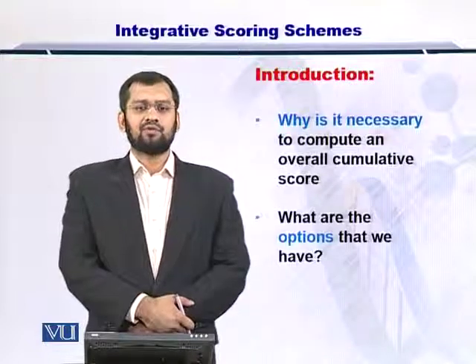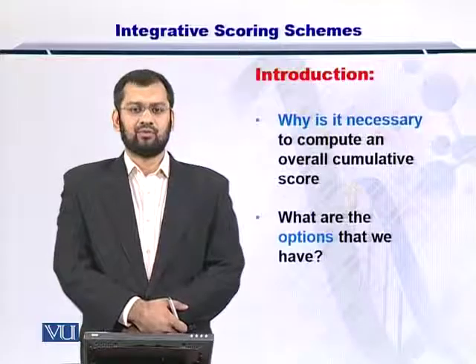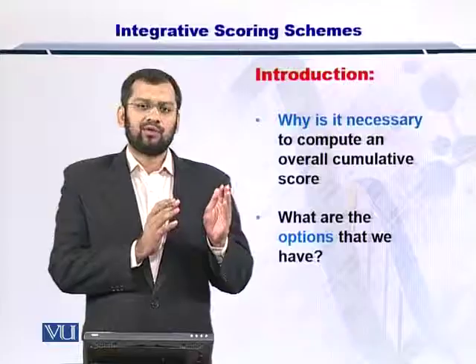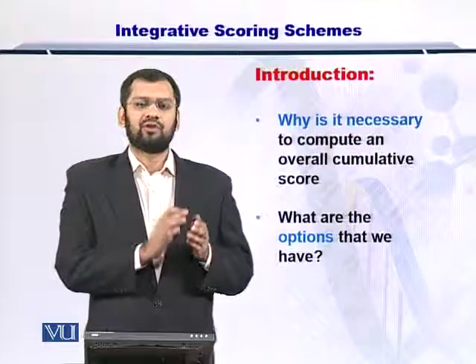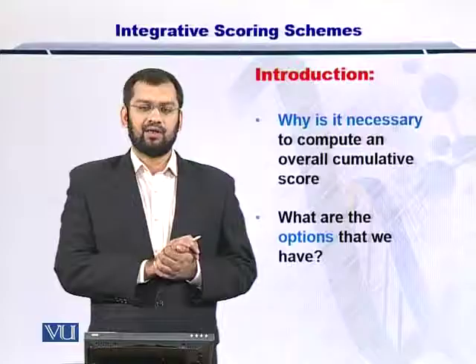Before we get into the scoring scheme, why is it necessary? It's a very important question. The score from the molecular weight, the score from the PST, and the score from the in vitro and in silico spectra is not normalized to a specific value.